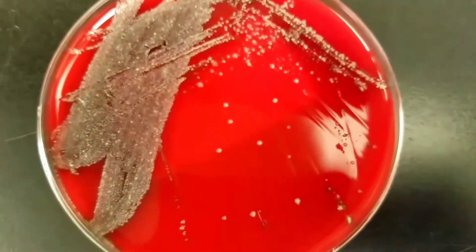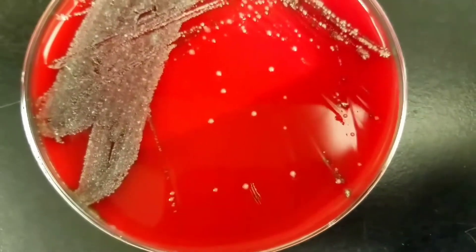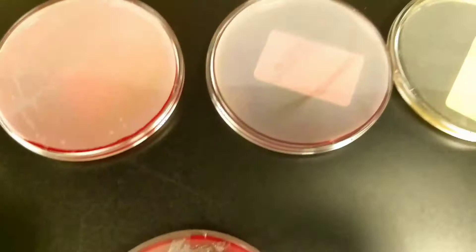You can see the growth on there — there's a couple different colonies from the throat culture that are growing, so pretty good growth and isolation on that one. Now I have set up the urine cultures.